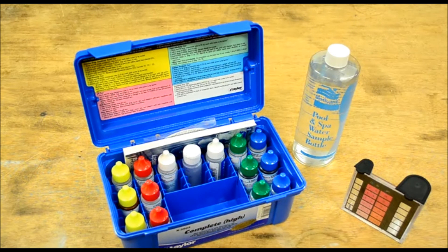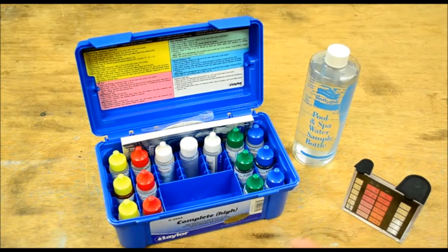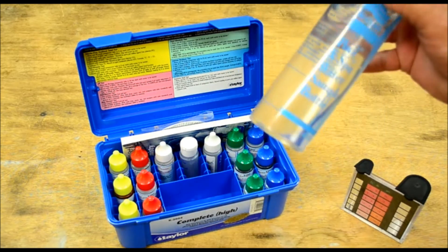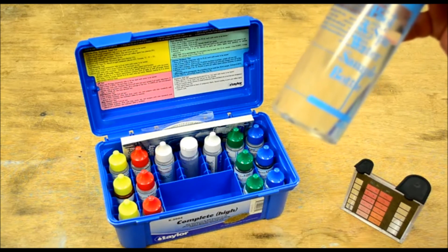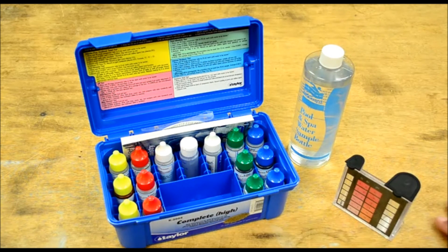For today's little project we're going to go through the steps and procedures of testing your pool water chemicals. We have the Taylor complete test kit, and I went ahead and got a good sample of pool water. The best place to do this is at the pool about 12 inches below the surface — you don't want to get surface water. We'll test chlorine, pH, alkalinity, calcium hardness, and cyanuric acid.